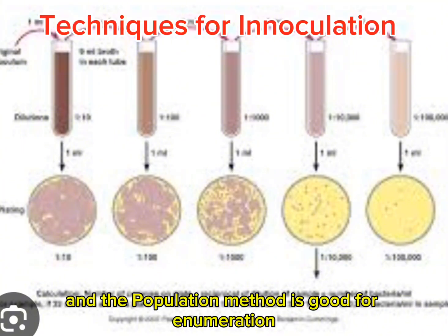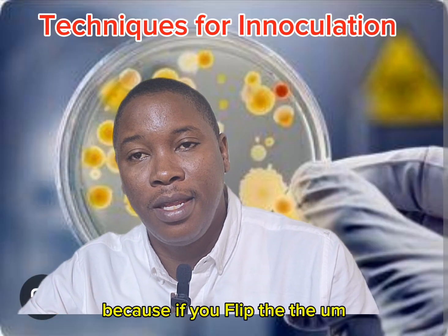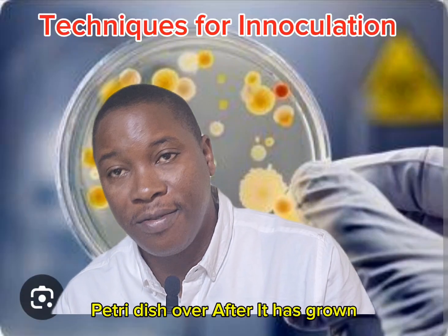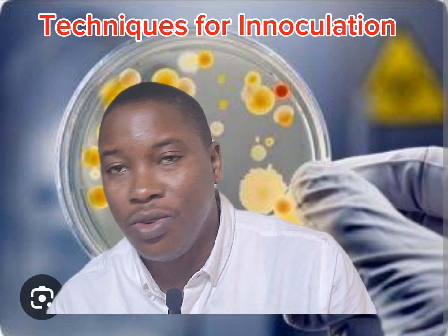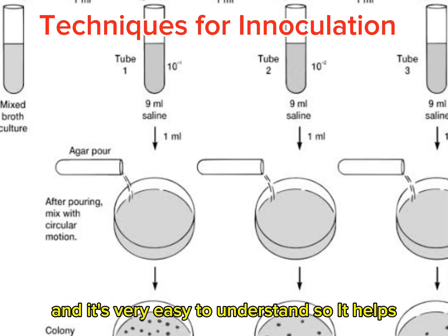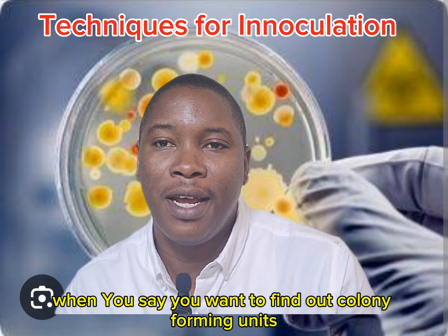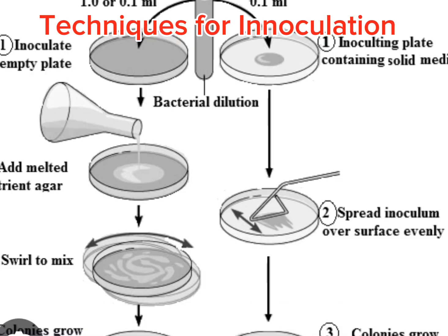The pour plate method is also good for enumeration, for counting. If you flip the petri dish over after it has been incubated and has grown, you can see the different colonies. You can count them quite easily, and it's very easy to understand. So it helps to provide data. When you want to find out colony forming units per gram, you can easily do your enumeration with this method.